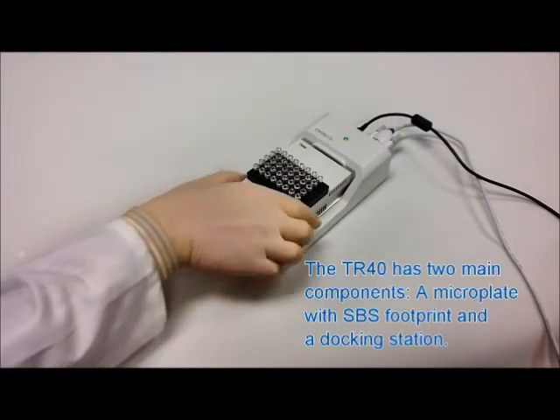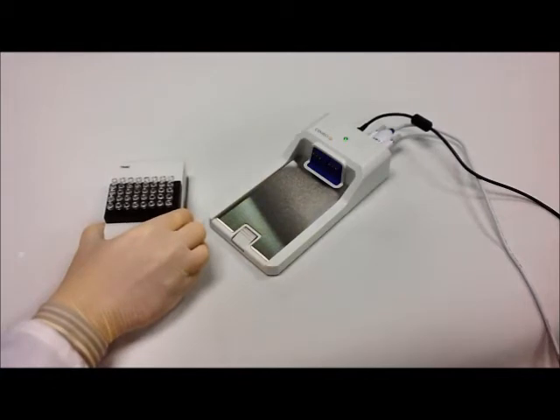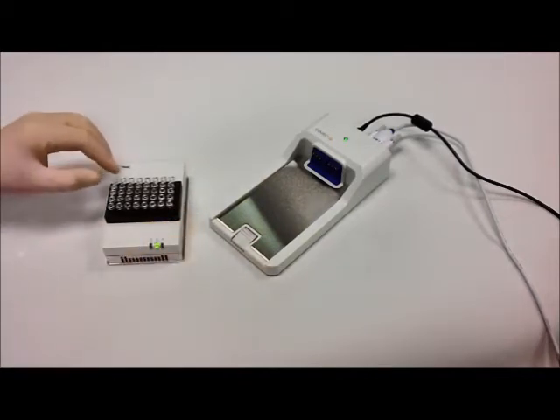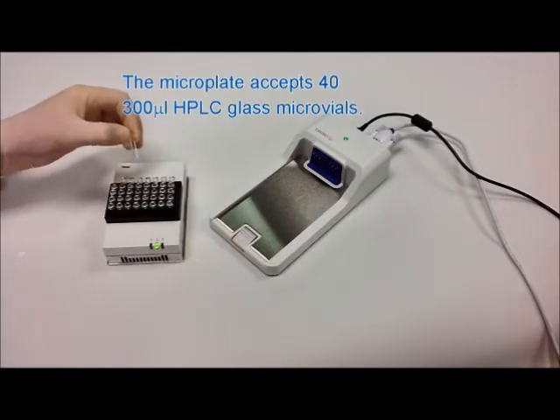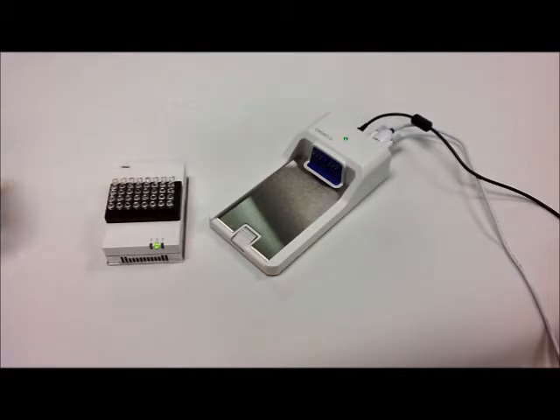The TR40 has two main parts: a microplate with a standard SBS footprint and a docking station. The microplate can accept up to 40 300-microlitre HPLC vials in five rows of eight, where each row is separately temperature controlled and recorded.